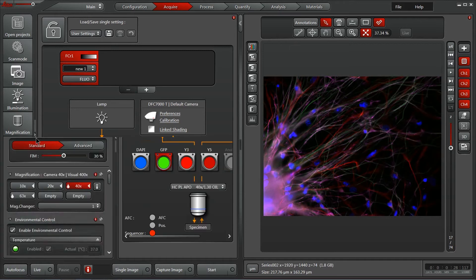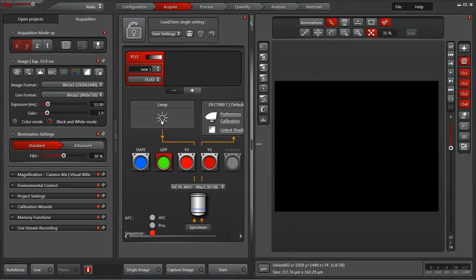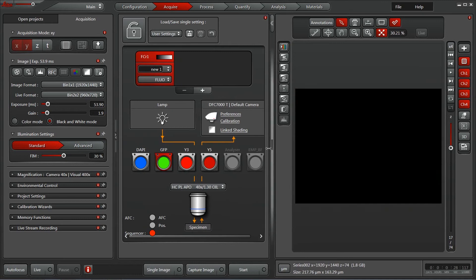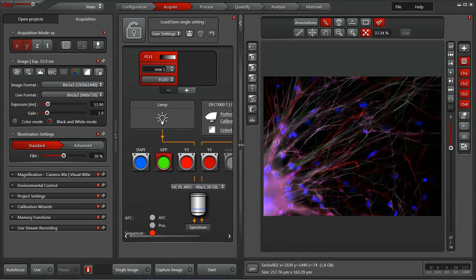Let me open these back up again. This particular panel can also freely be adjusted — you can grab a hold of this double dot, double line here, and adjust the size.